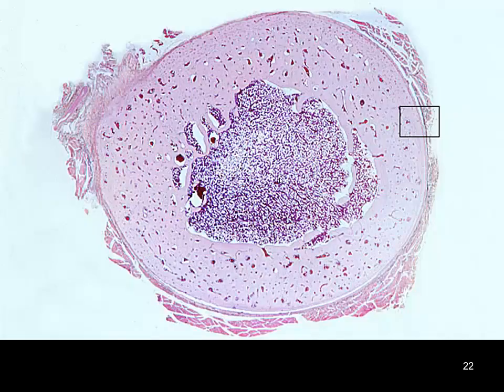So here we have another cross section of bone, and you can really see this is more mature bone. We're looking at a lot of blood vessels, and you can see all the red in here. These are the blood cells. So very thick, compact bone on the periphery, spongy bone lining the marrow cavity in here.